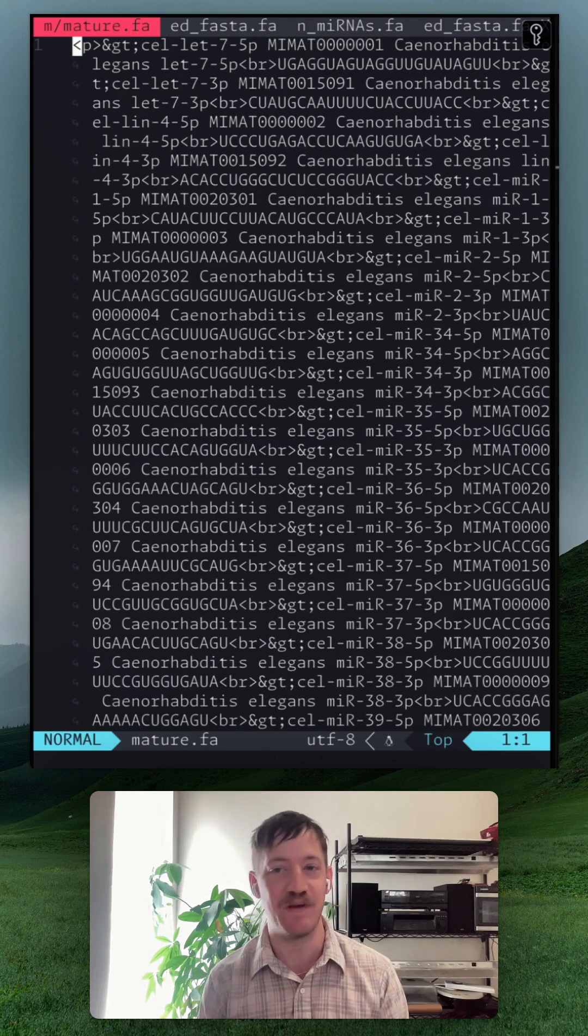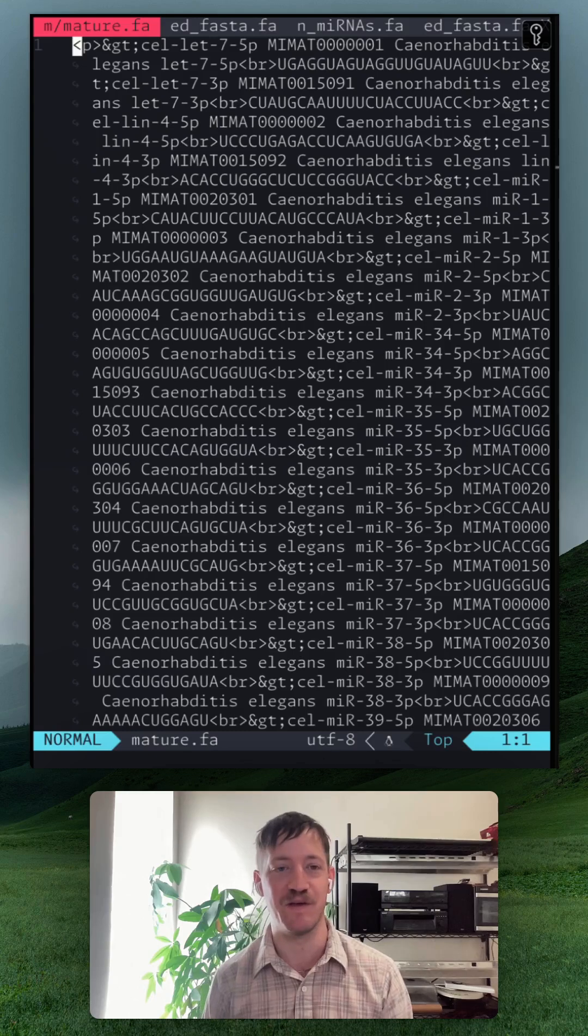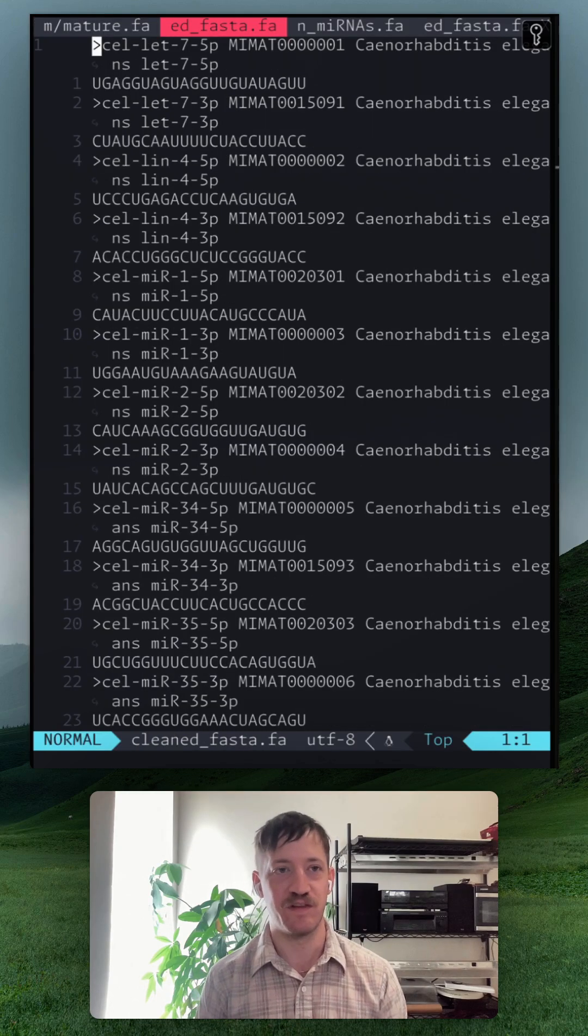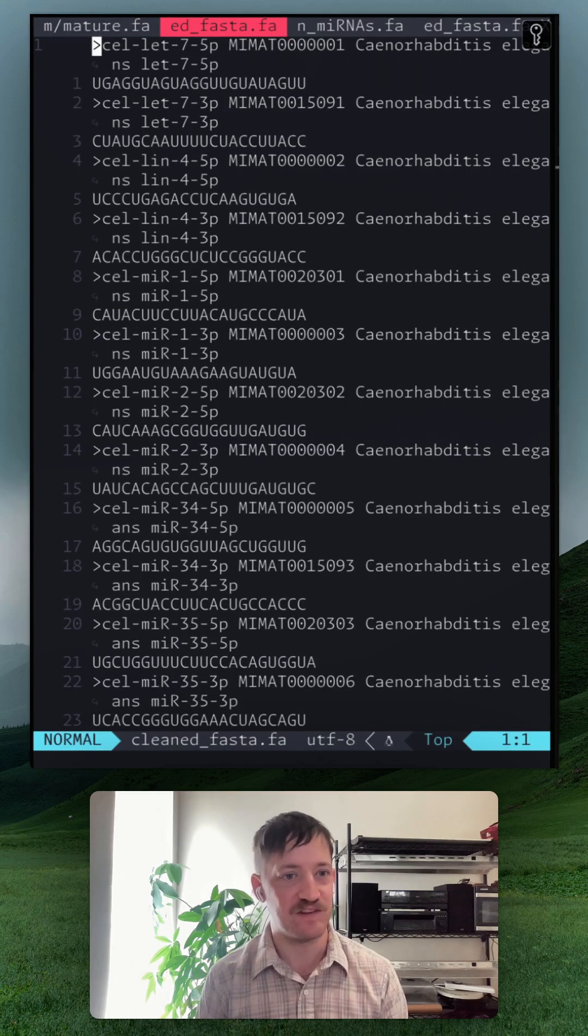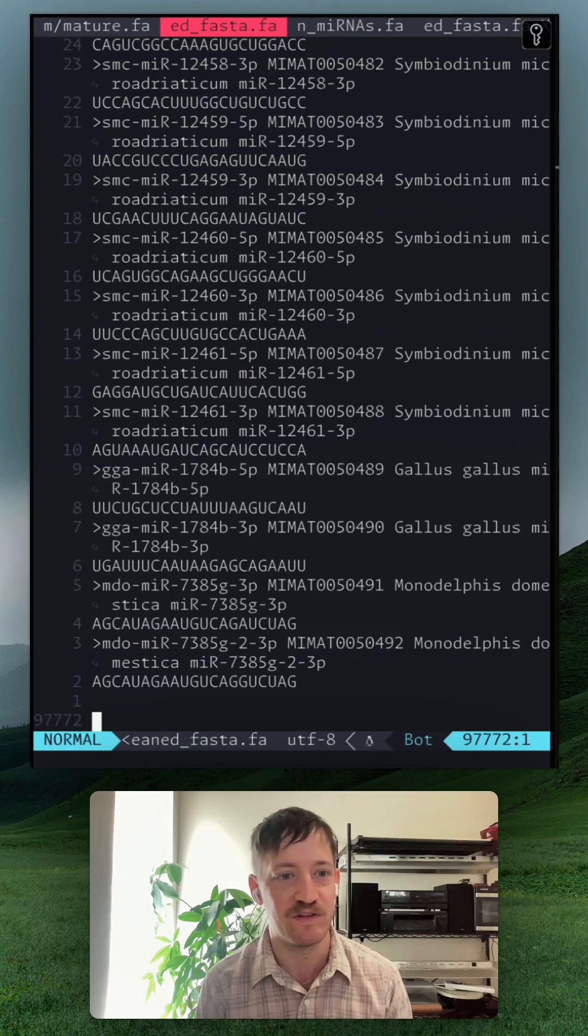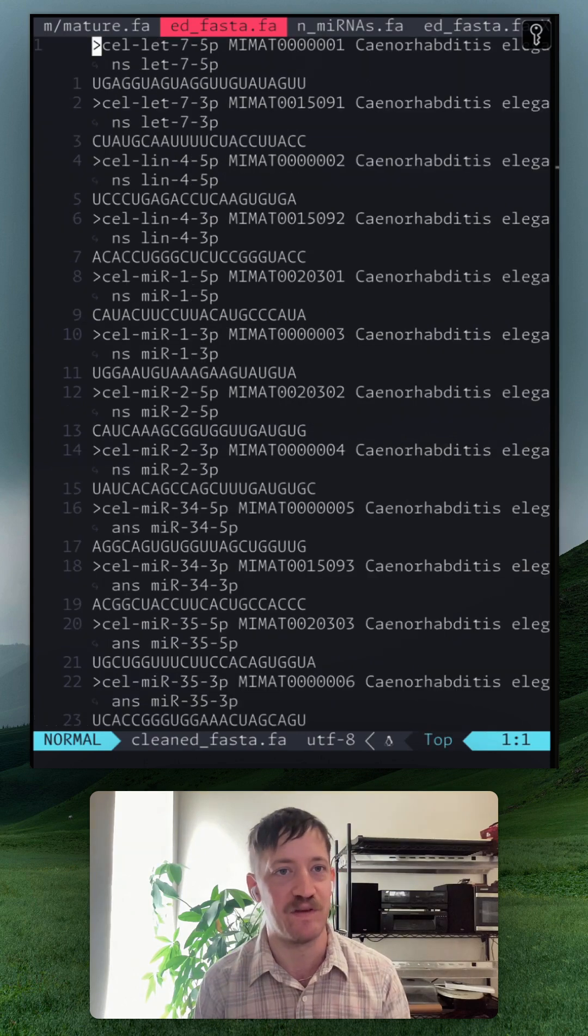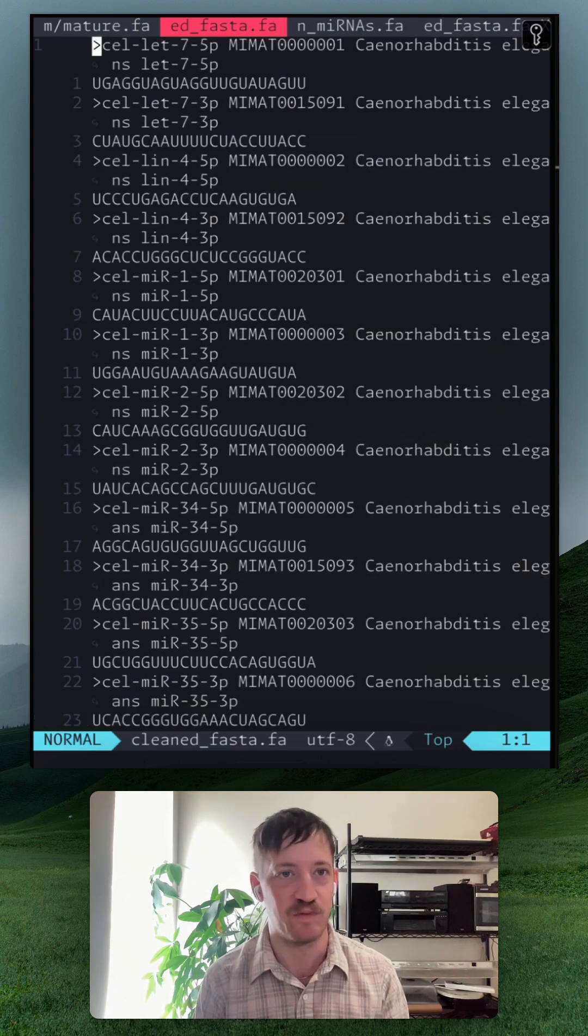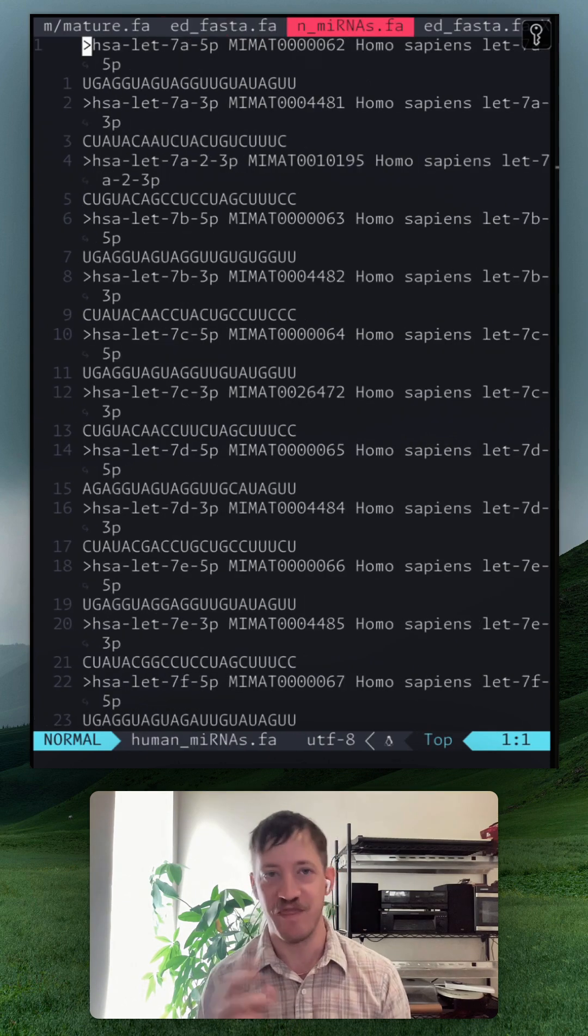So the first step is to convert this HTML into FASTA. Then you'll notice that this file actually contains every microRNA sequence in existence. Our next step is to just grab the species we're interested in.